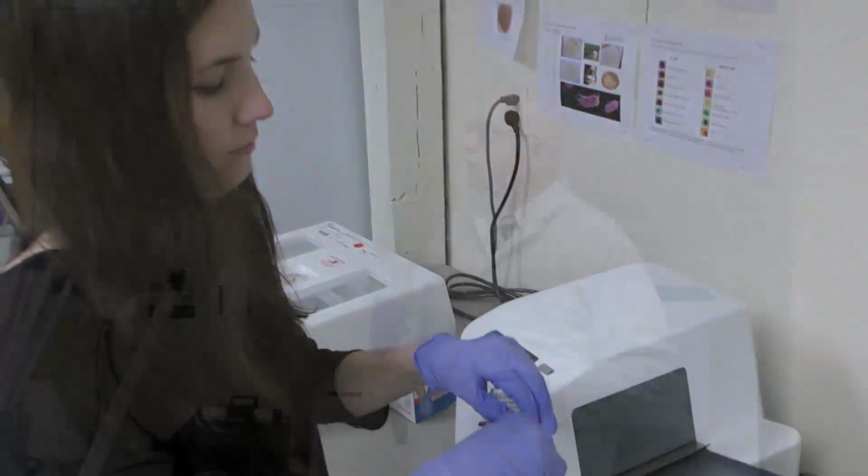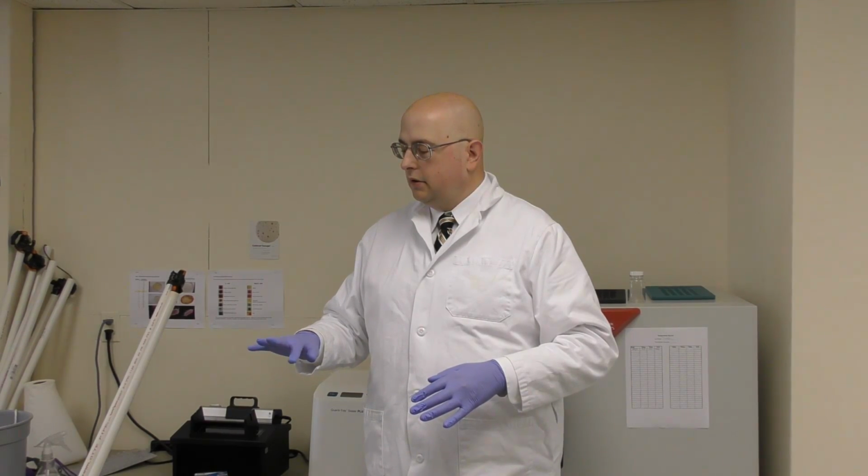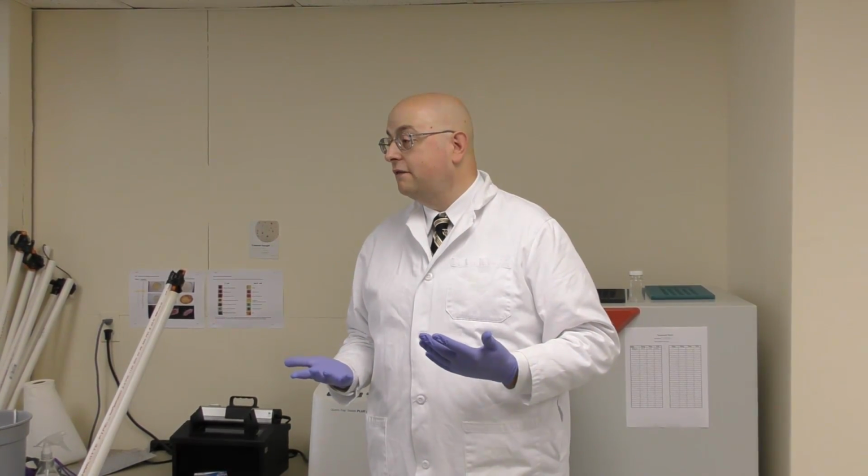We do recommend that folks using a UV lamp have glasses or UV goggles that have a UV coating. If you're going into the field and, say, you're sampling in the stream, you want to make sure you wear adequate footwear, hip waders, or sturdy shoes. Don't go into a creek at any time with open-toed sandals, or even the Croc type footwear, because things can poke through the holes and get into your foot, and you don't want a piece of broken glass or anything else poking in that foot because you could potentially get an infection or other issues.